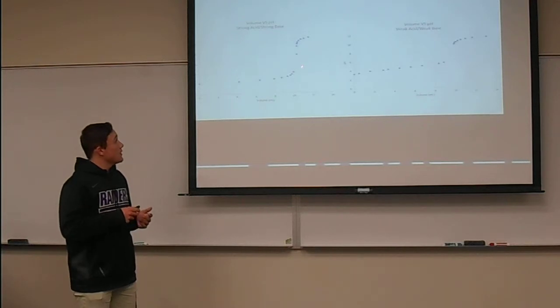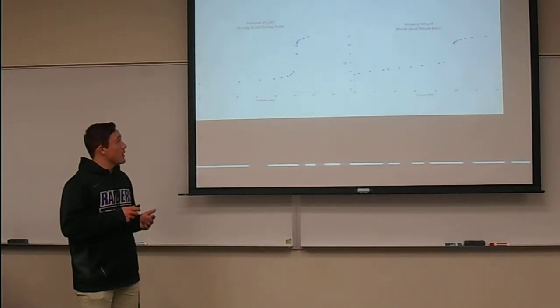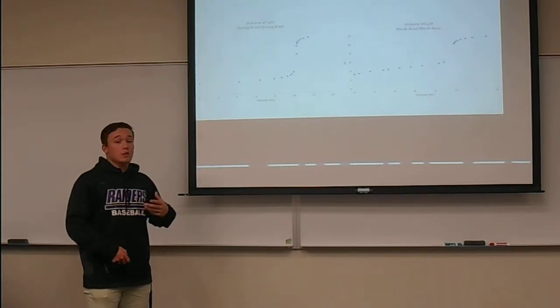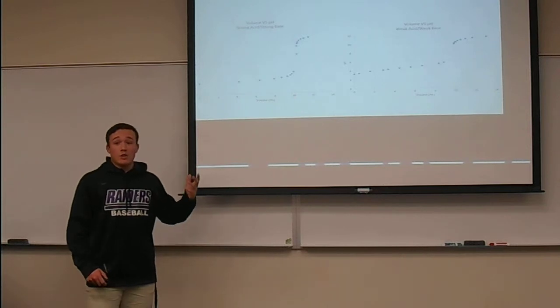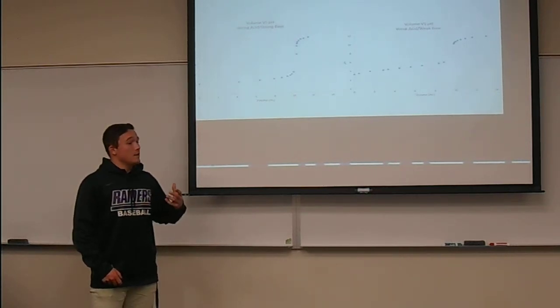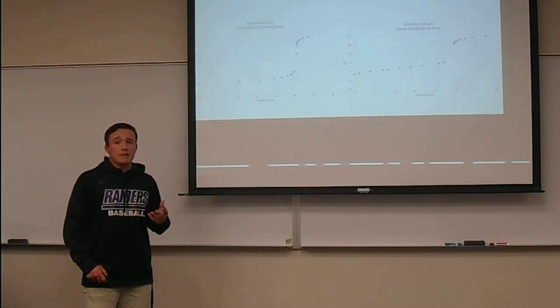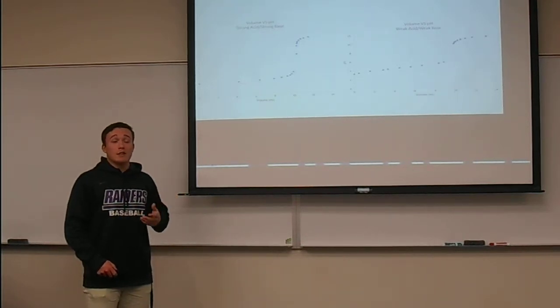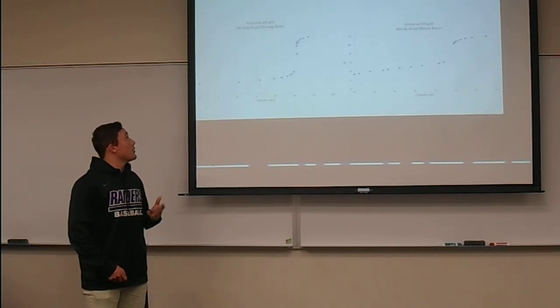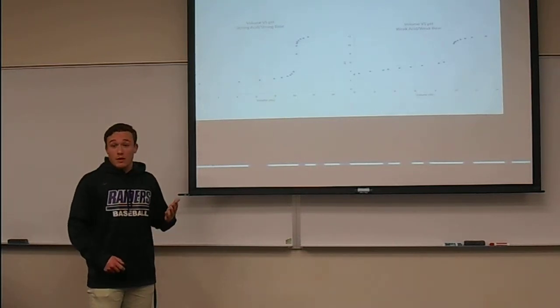And right here is the jump that I was talking about earlier. That's when you have put so much base, your sodium hydroxide, into the solution that the acid can't produce as many hydronium ions. So the production slows down, which means the pH shoots up in the solution.